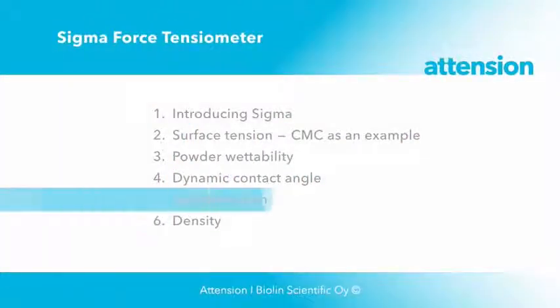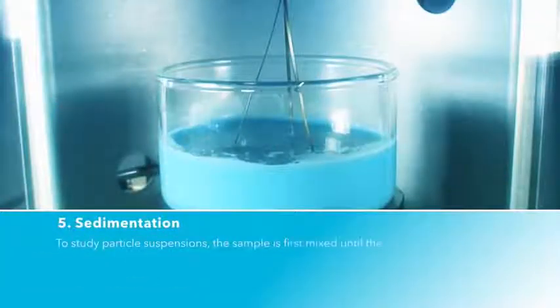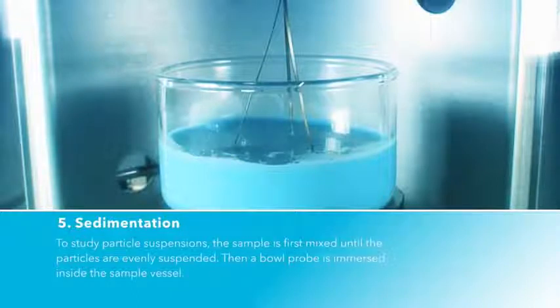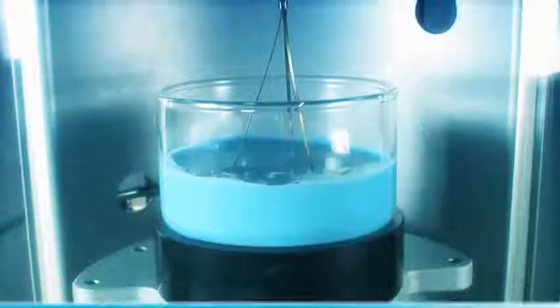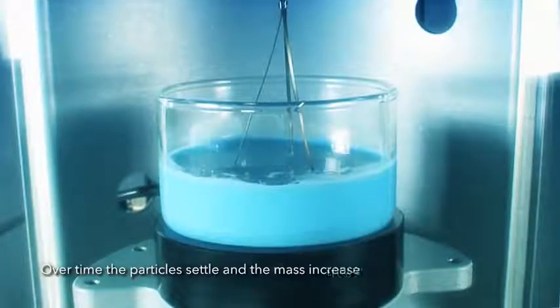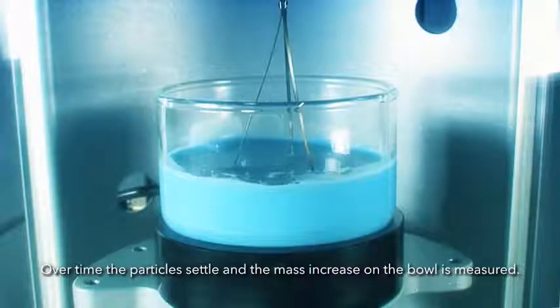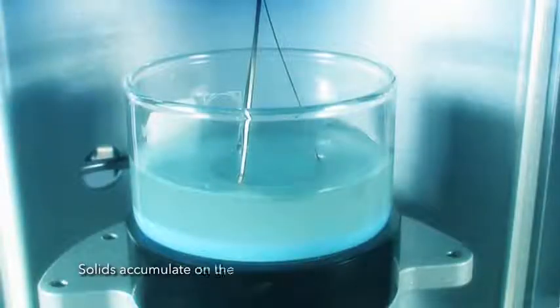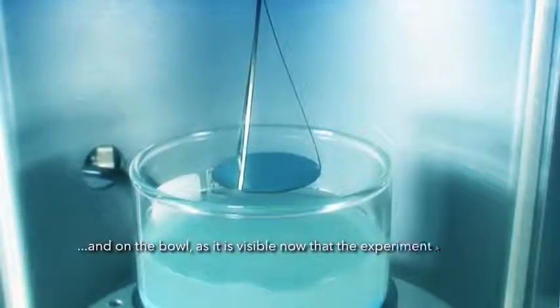Sigma can also measure sedimentation. To study particle suspensions, the sample is first mixed until the particles are evenly suspended. Then a bowl probe is immersed inside the sample vessel. Over time, the particles settle, and the mass increase on the bowl is measured. Solids accumulate on the bottom of the vessel and on the bowl, as it is visible now, that the experiment is over.